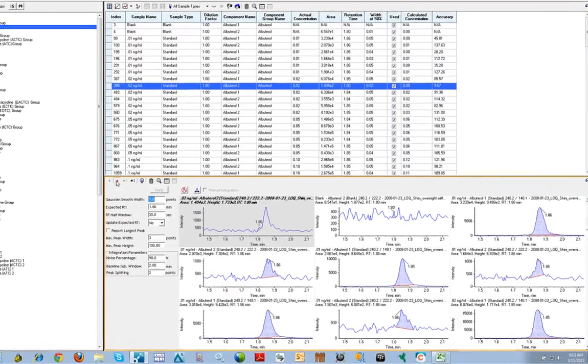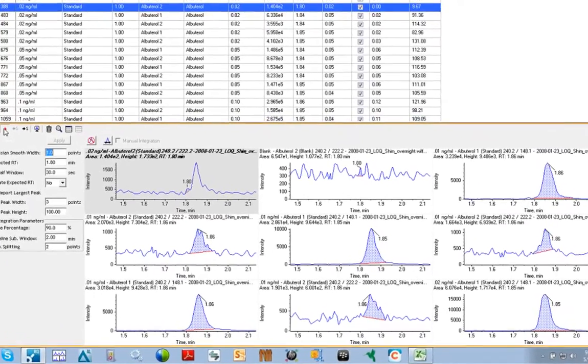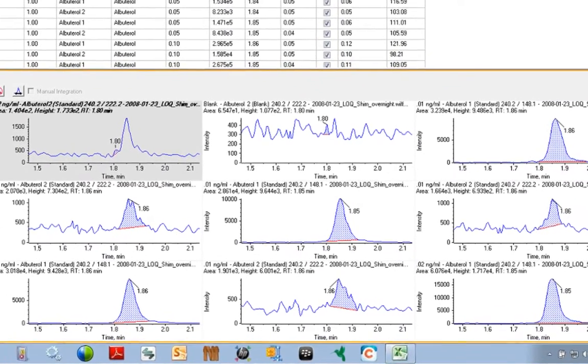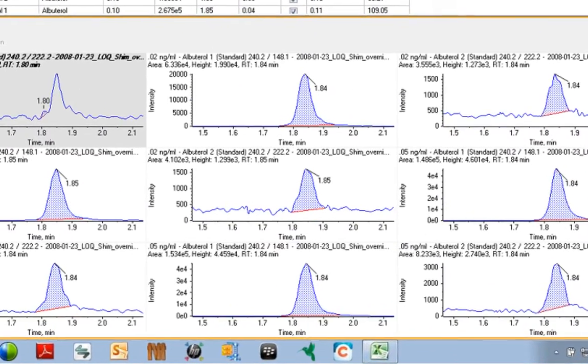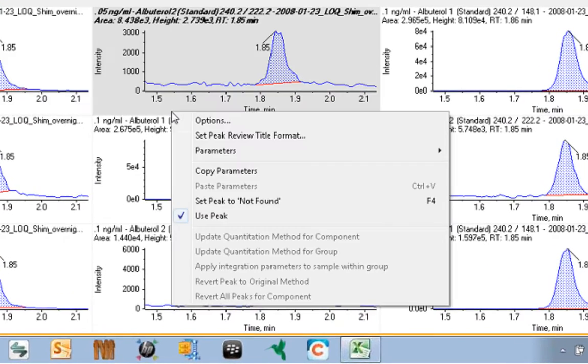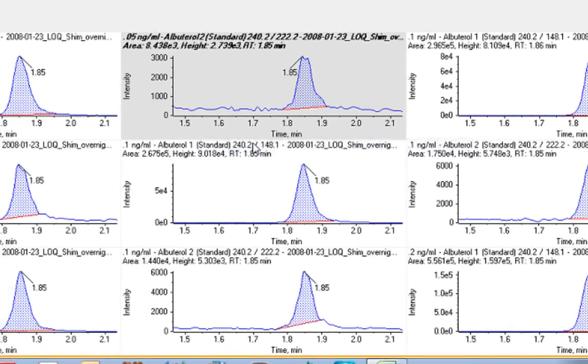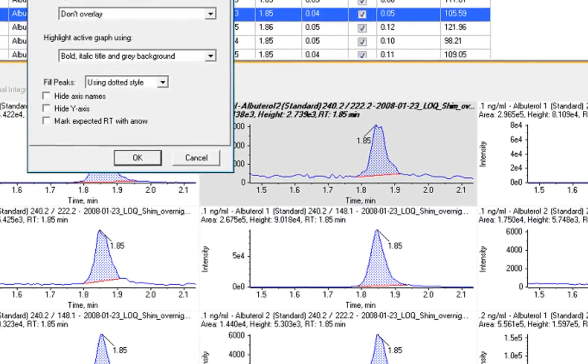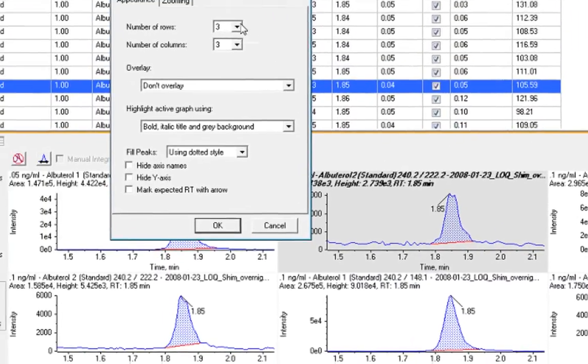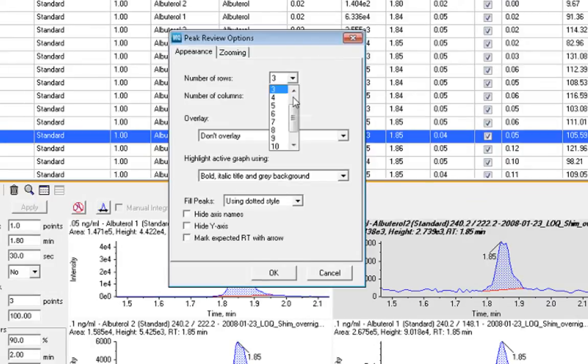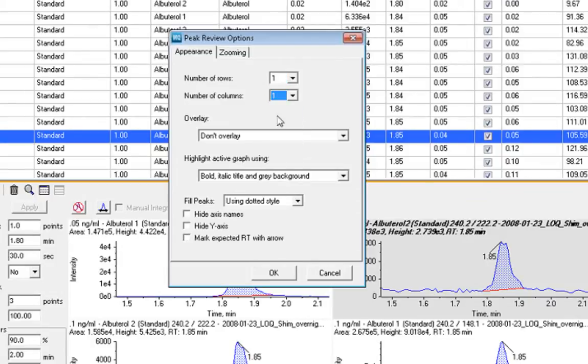The chromatographic view can also be customized. By right-clicking in the window and selecting Options, we are able to set the number of rows and columns of chromatograms we want to display, which will allow you to review as many or as few chromatograms as you'd like in a single window.